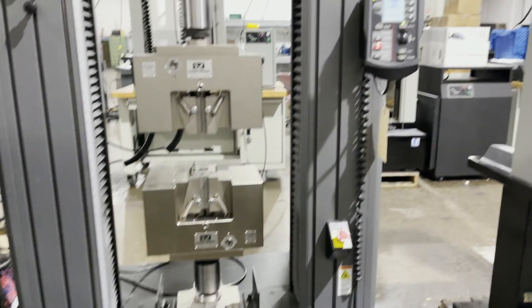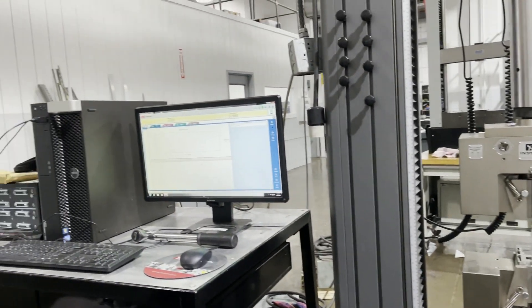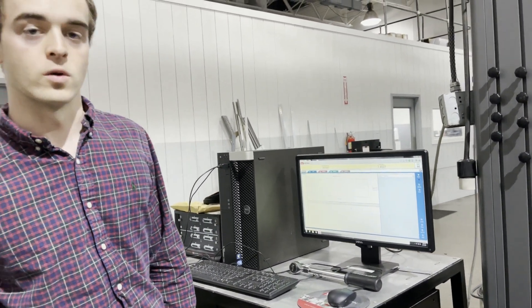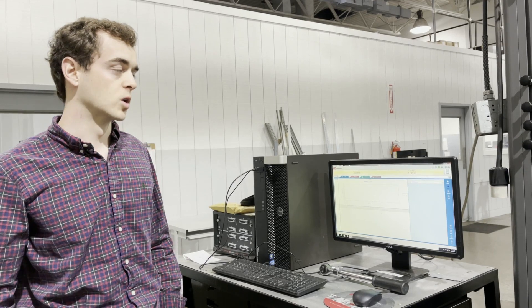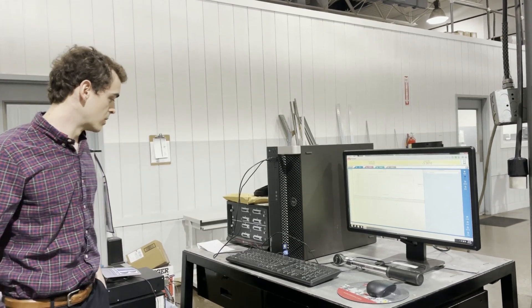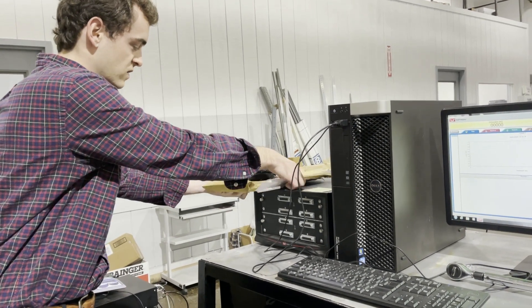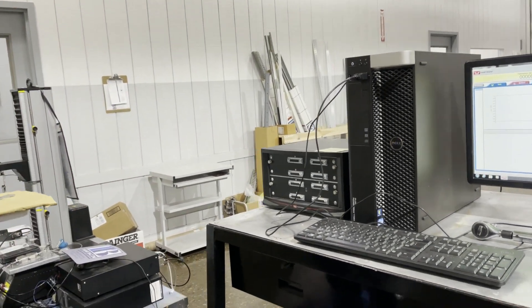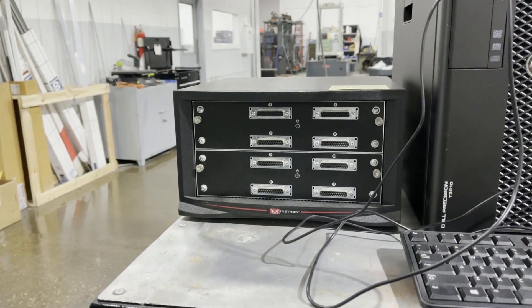We do have quite a bit of tooling and fixturing that we don't have listed right now, but if you want to reach out and ask about that tooling, we're more than happy to show you what's available. We're going to include strain gauges with this — I believe there are 12 of those. It will also come with a strain conditioning box, original Instron, with 12 channels.